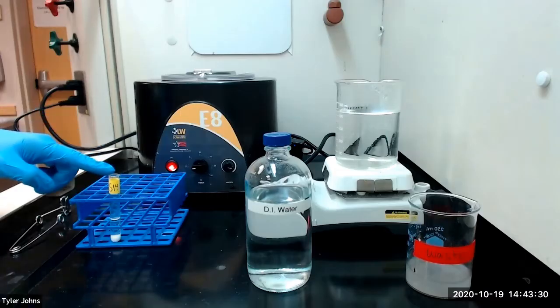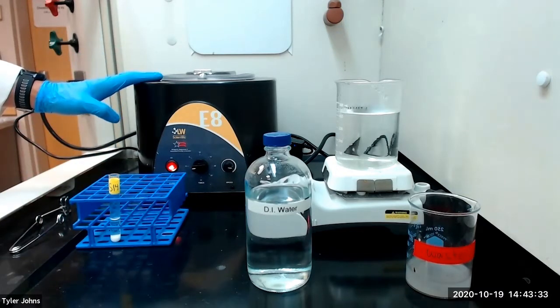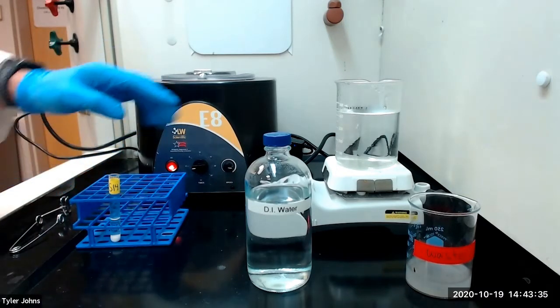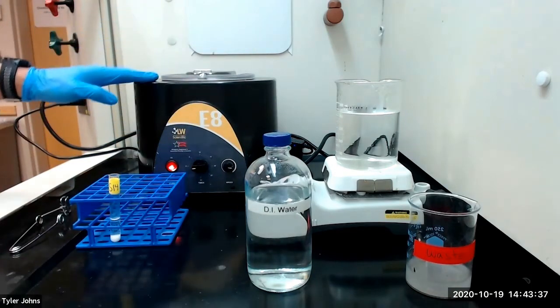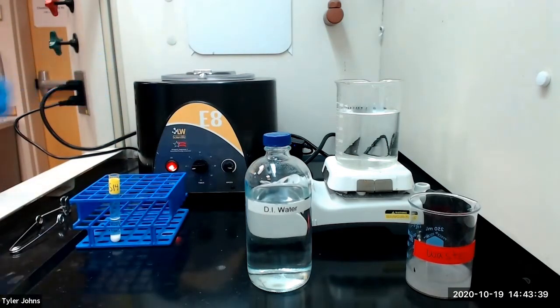After 10 minutes, we will centrifuge our mixture and discard the liquid. We will then wash our precipitate with deionized water, centrifuge again, and discard the wash liquid.